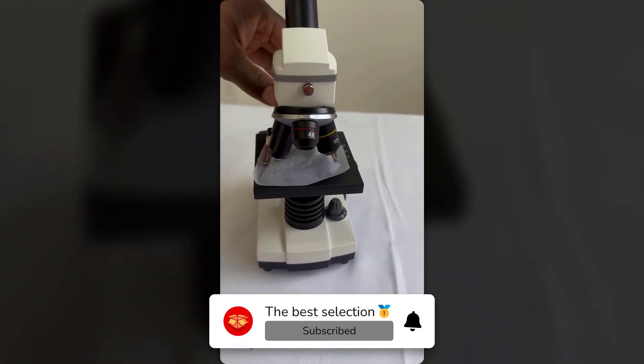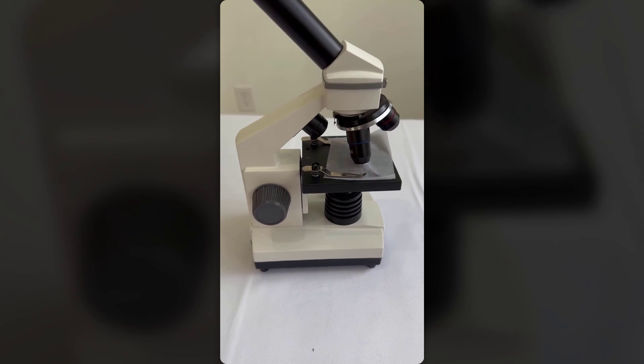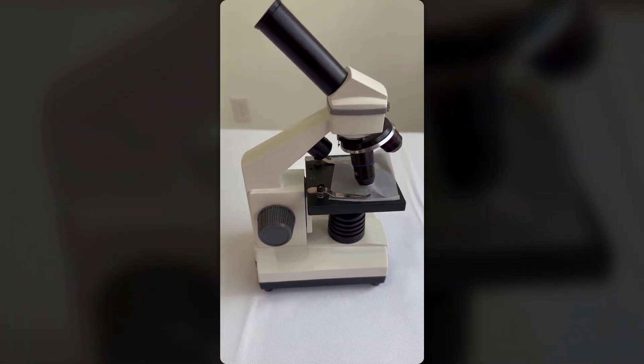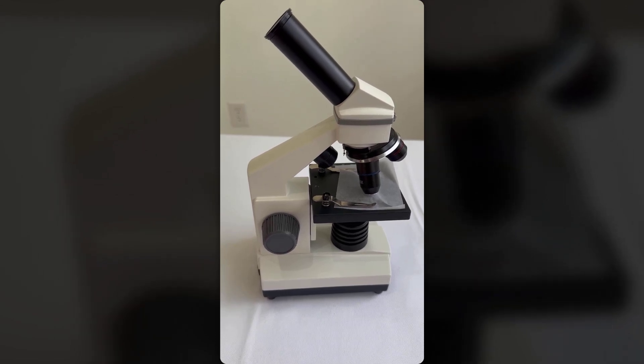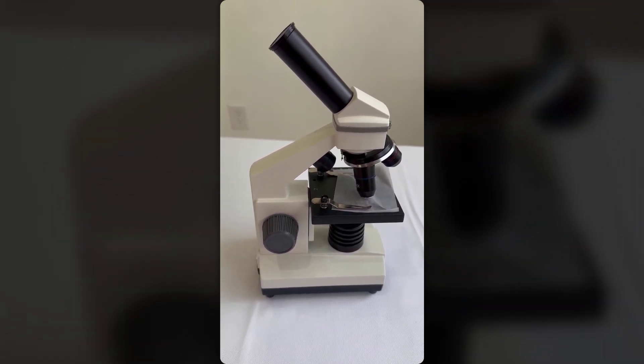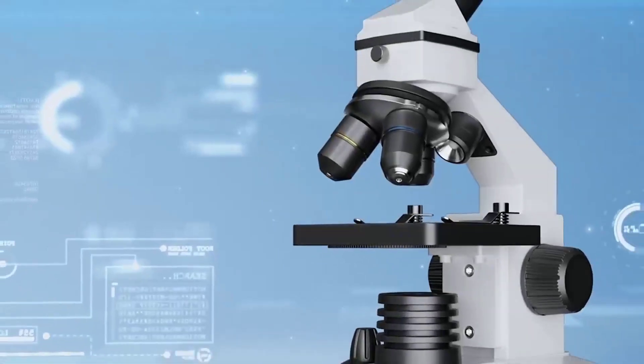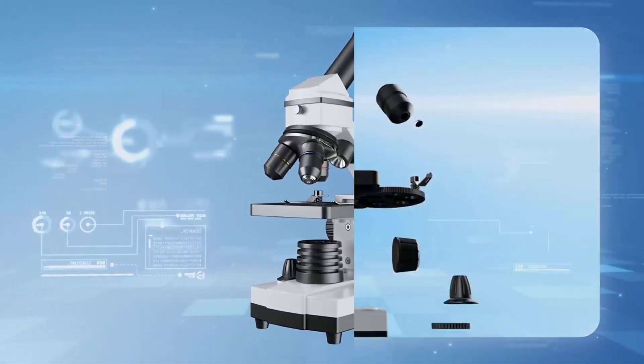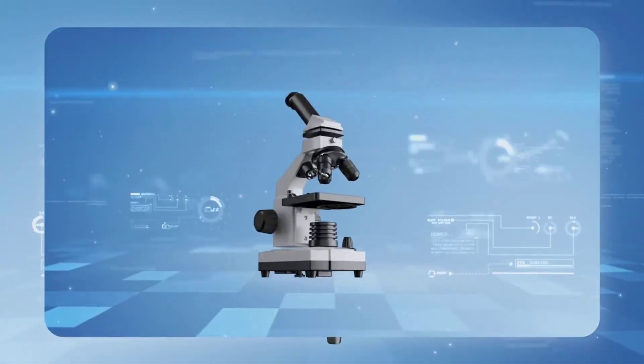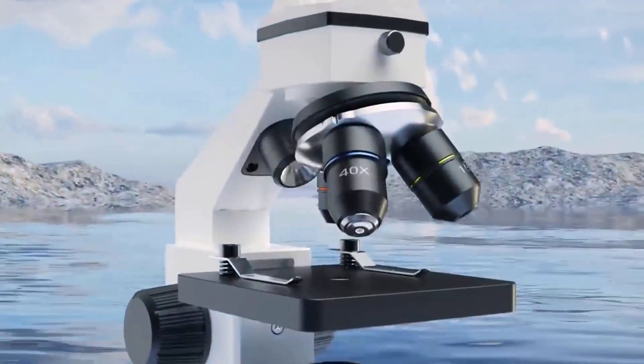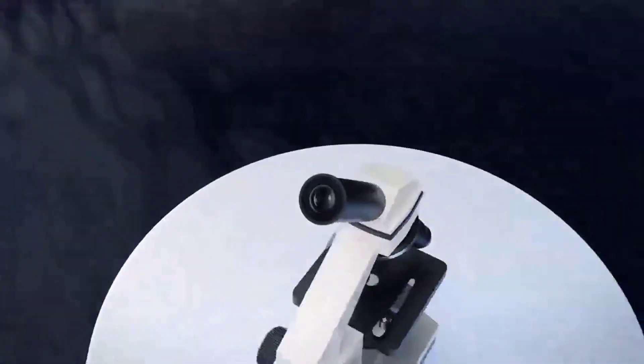Where the Zovtron truly excels is its extensive accessory package. The combination of a phone adapter, Bluetooth shutter, and 28 professionally prepared slides enables immediate exploration straight out of the box. This complete setup proves invaluable for sparking scientific curiosity, especially when introducing young minds to microscopic discoveries like viewing cellular structures for the first time.